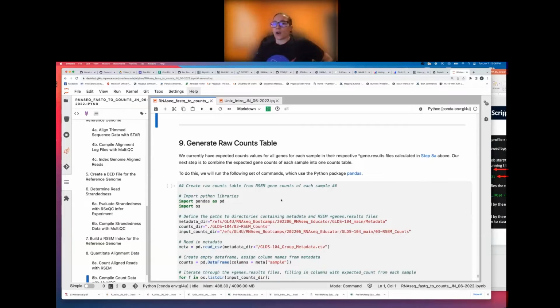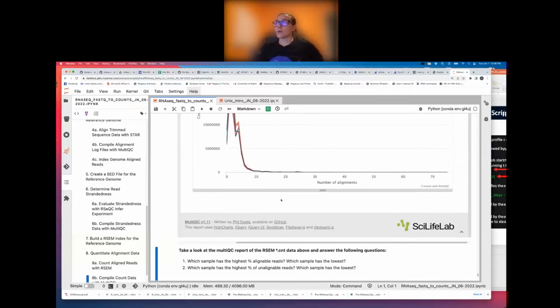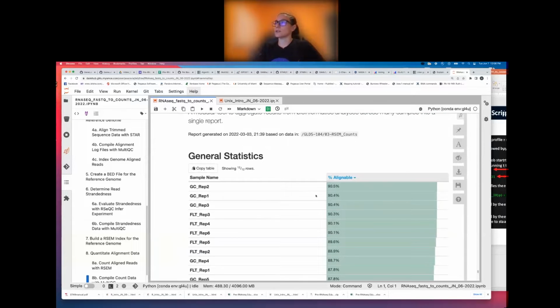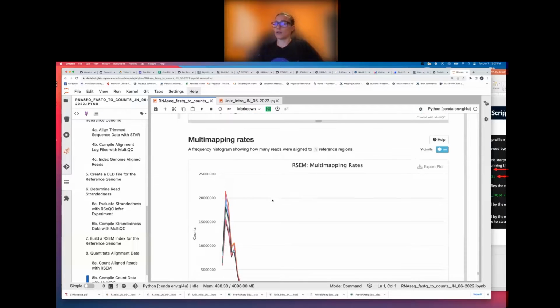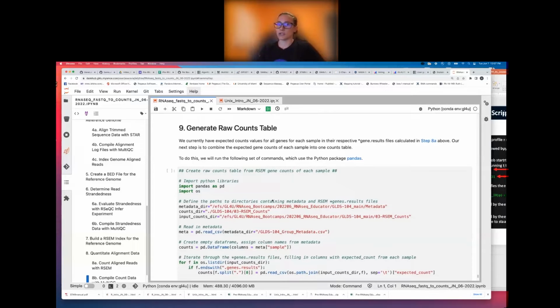So moving on now, are there any questions about RSEM, how RSEM does its quantitation, or interpreting the multi-QC report for learning how many were alignable? Okay, great. If you do think of a question, just feel free to interrupt me or shoot your question in the chat, and I'll stop and answer it.